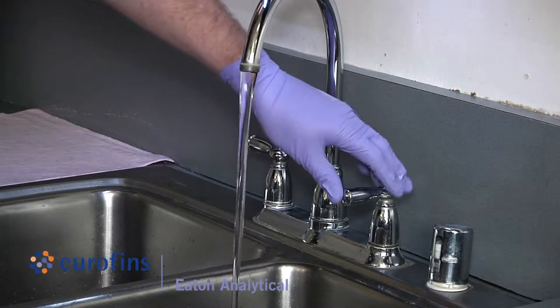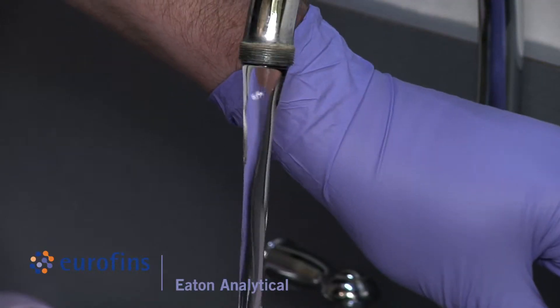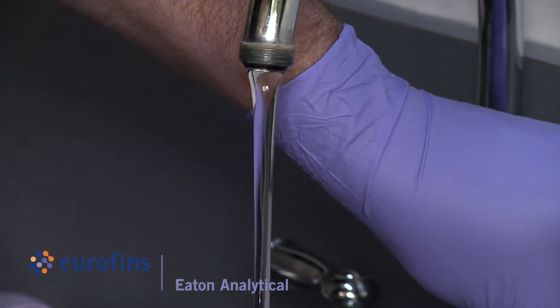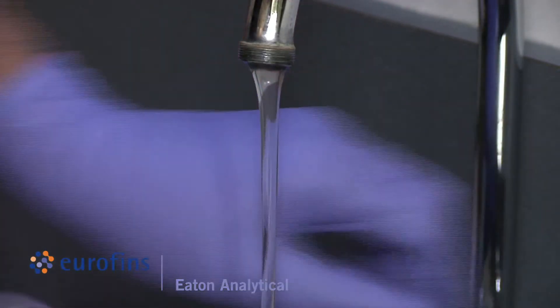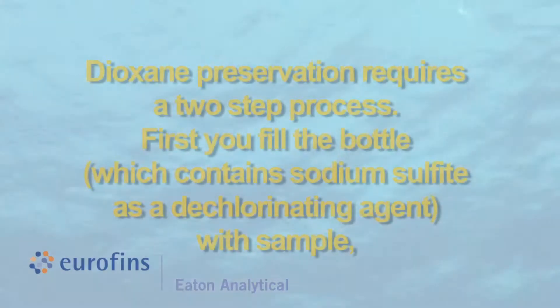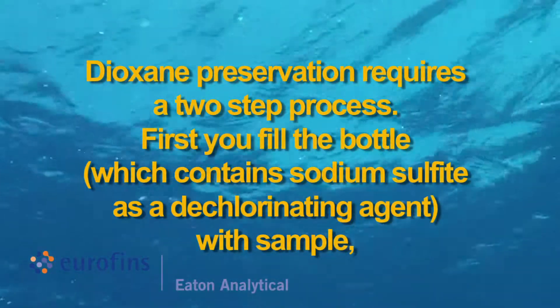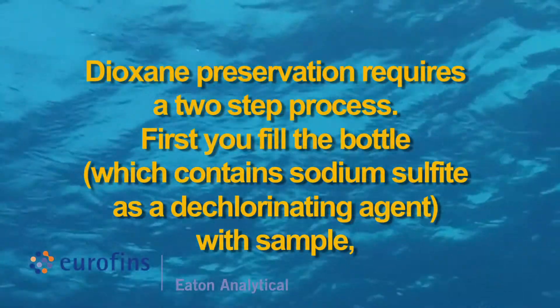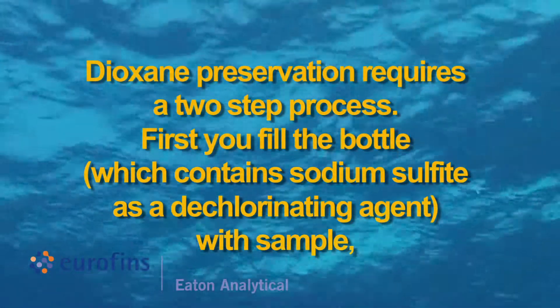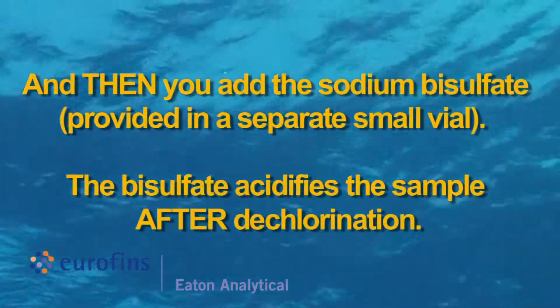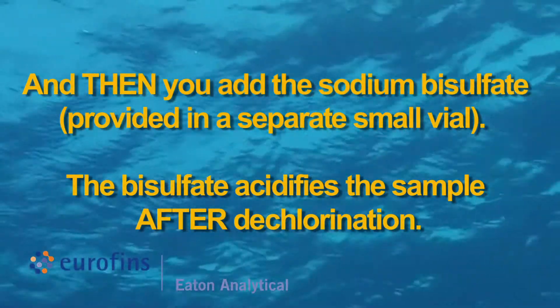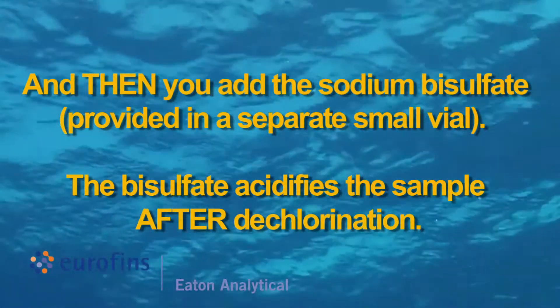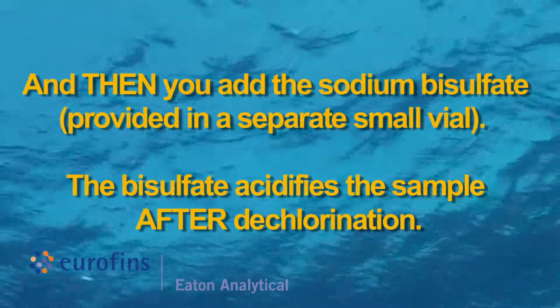After five minutes, slow water flow to thickness of a pencil to minimize splashing. Dioxane preservation requires a two-step process. First you fill the bottle which contains sodium sulfite as a dechlorinating agent with sample, and then you add the sodium bisulfate provided in a separate small vial. The bisulfate acidifies the sample after dechlorination.